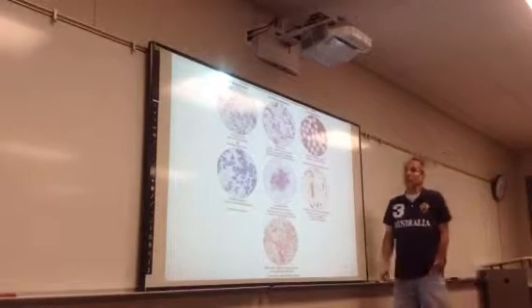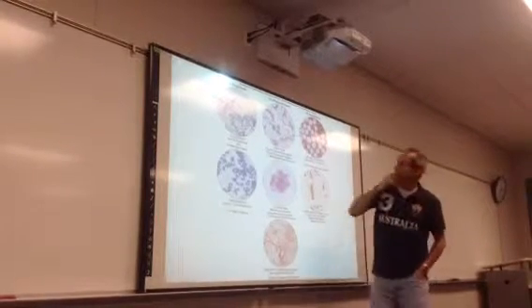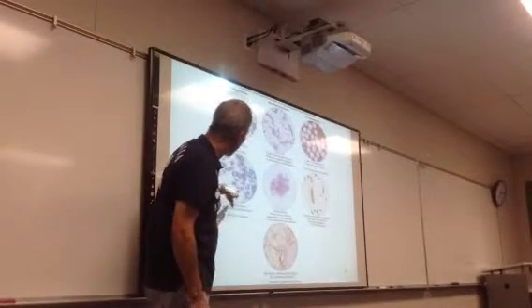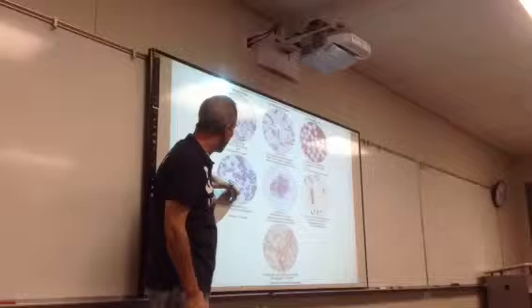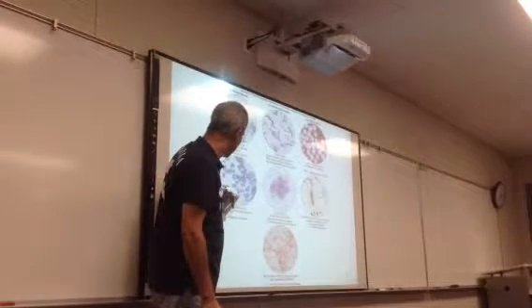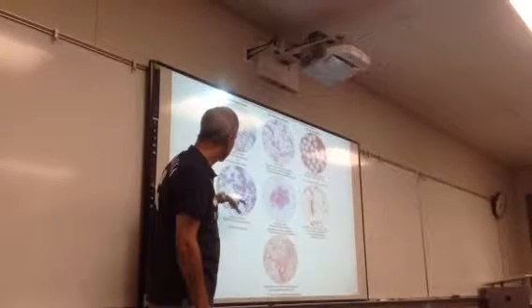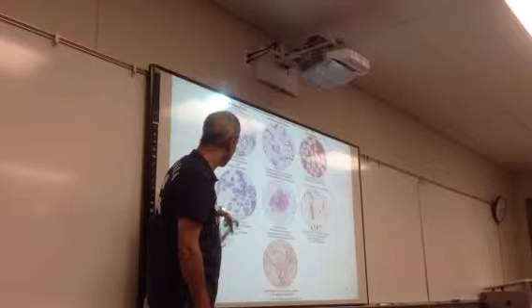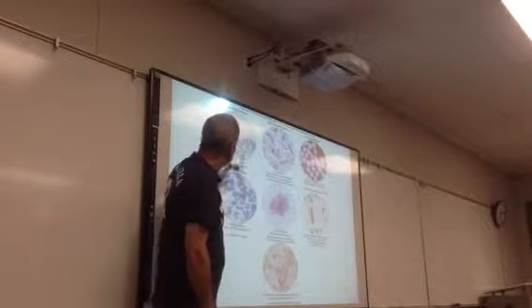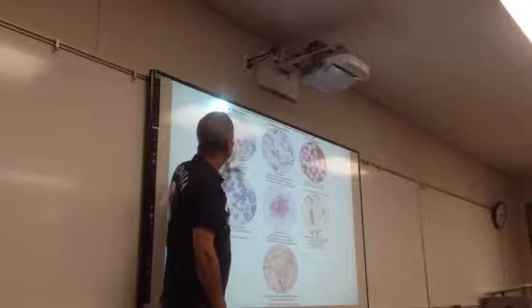And notice if I use one stain like crystal violet or methylene blue, I can clearly see that these are rod-shaped organisms, and that these two are probably diplococci. They're round-shaped. Corynebacterium, they're supposed to be gram-positive rods, but they're very, very small rods. They're very short rods. So I'm not going to say they're diplococci. So these are very small rods because of this organism here. Notice that I can clearly see that these are rod-shaped. You see that? So that's why we use a simple stain.